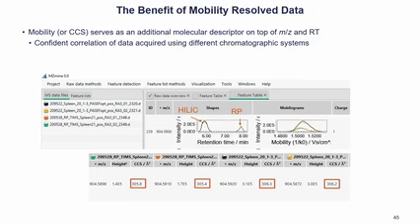And these were aligned by the mobility values. So we have the same mobility value because it is the same compound. So we can again use the mass and the mobility value to align these data sets, even though the retention times are very different.